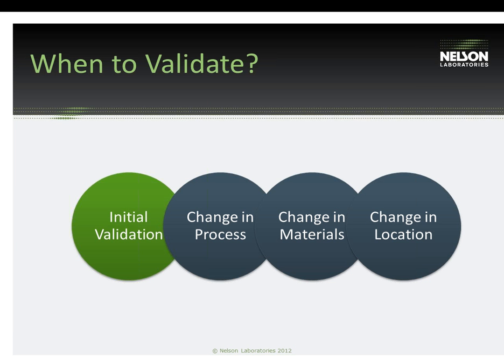And with this IPA rinse, this customer was doing routine monitoring with TOC, which is one of the test options that we'll go over later in this presentation. And they were seeing a spike in their TOC data. And we were talking with them saying, have you made any changes to your process? Where could this spike be coming from? And they were telling us about the IPA rinse, and they were able to conclude that in their process, the IPA was not being allowed to evaporate in that tube, and so there were residues being left behind.